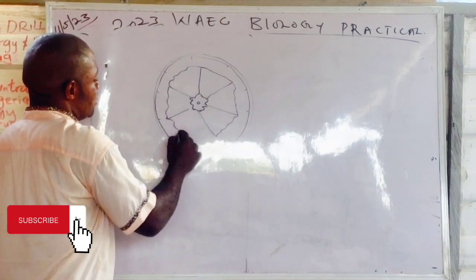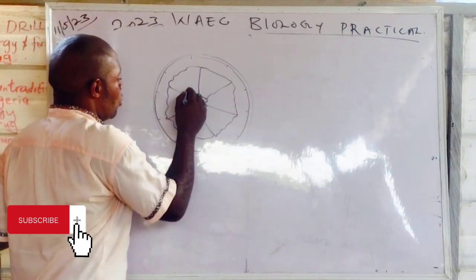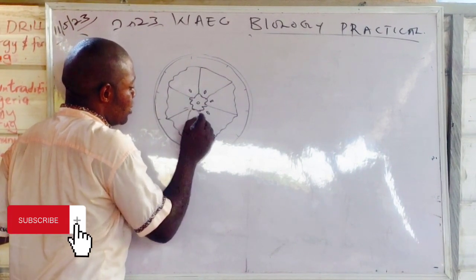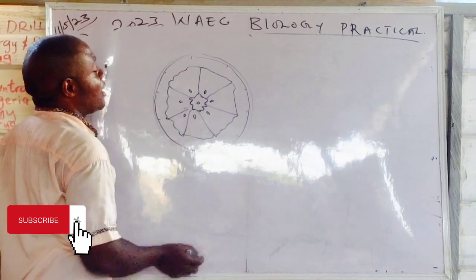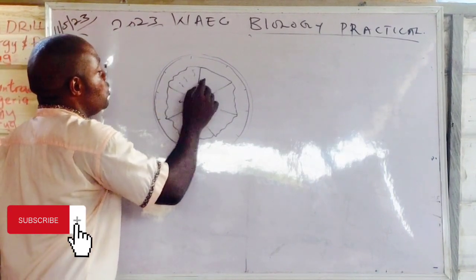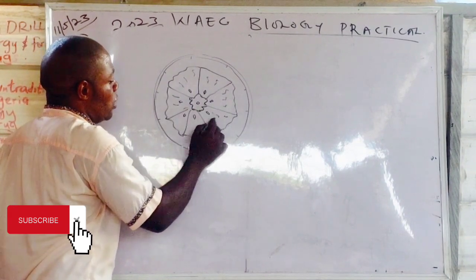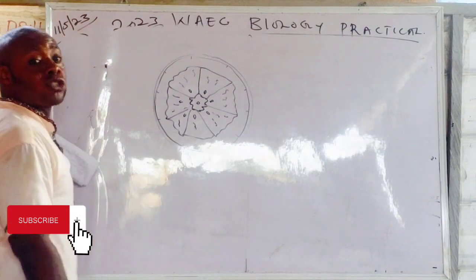This is just a sketch. Then from there, you put your seed in each chamber. After that, you put something like all the juicy sac. You put something like a line to show a juicy. Yes, and your orange. Then don't forget your title.